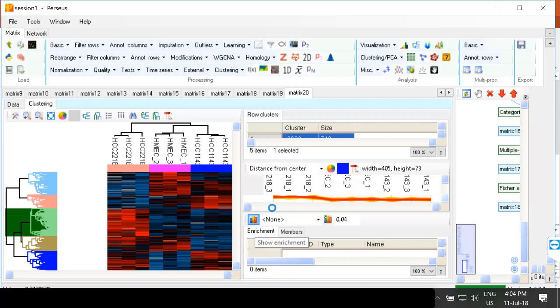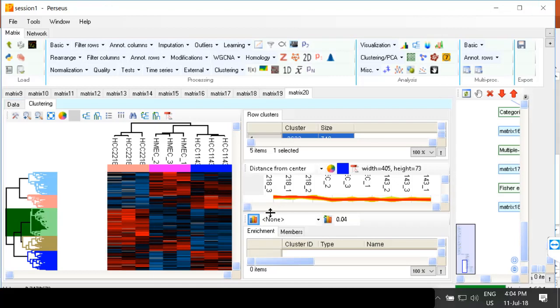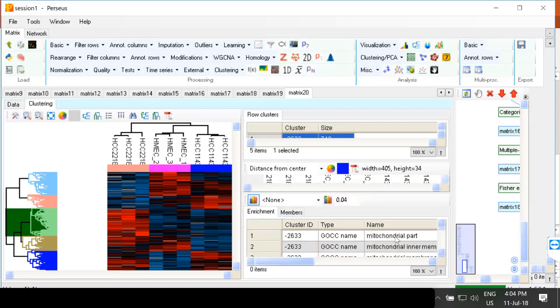And it will again calculate what terms are enriched in this cluster, compared, however, only to what we have in this filtered data set. So this is again a suboptimal way of doing the enrichment, because you should always remember against what background you're enriching. And in this case, we have already filtered only for significant values. So we're really enriching only against the proteins that we have in here. But it can still give you some idea of what kind of processes might be really different among the significant hits.